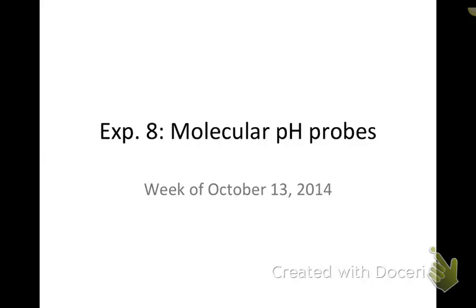Welcome to the video lecture for Experiment 8, Molecular pH Probe. pH is very important in chemistry, as many rates of reactions depend very strongly on pH. You have measured pH in laboratories before, often using a pH meter.